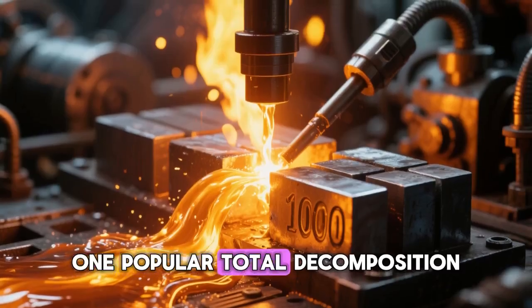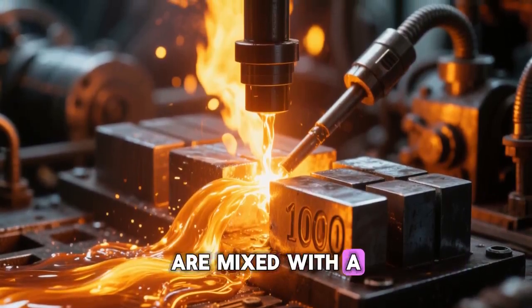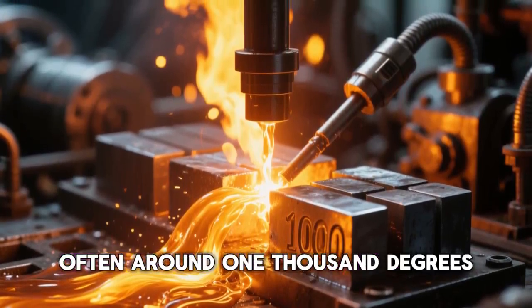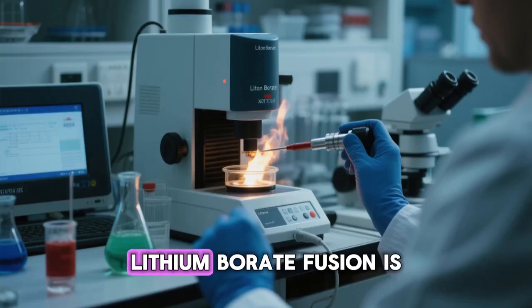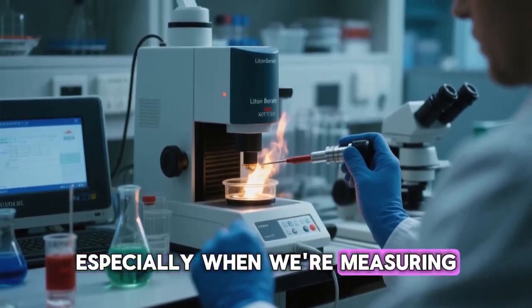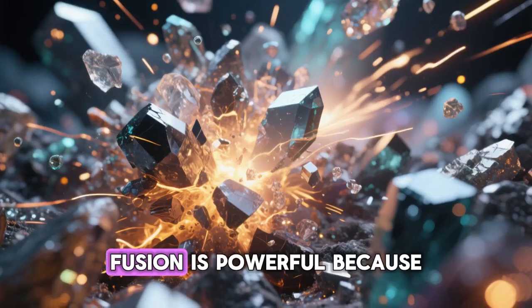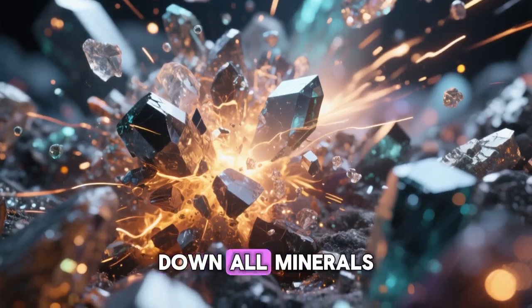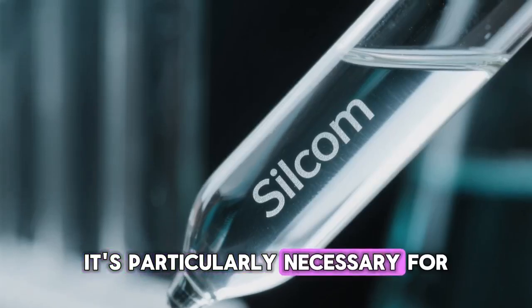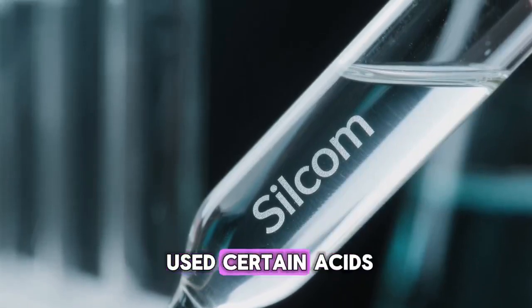One popular total decomposition technique is fusion. Here, samples are mixed with a chemical called a flux and heated to scorching temperatures, often around 1000 degrees Celsius. Lithium borate fusion is a common choice, especially when we're measuring major and minor elements with XRF or ICP-AES. Fusion is powerful because it breaks down all minerals, releasing every element. It's particularly necessary for determining silicon, which would otherwise be lost if we used certain acids.